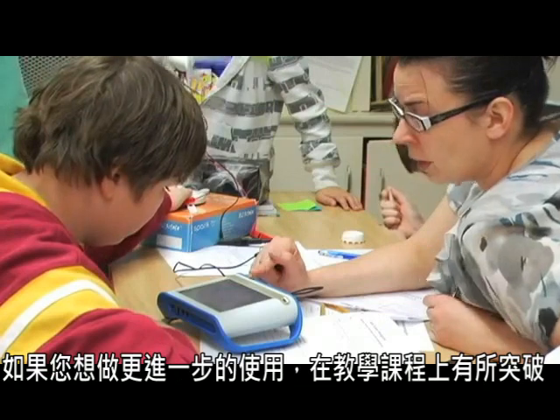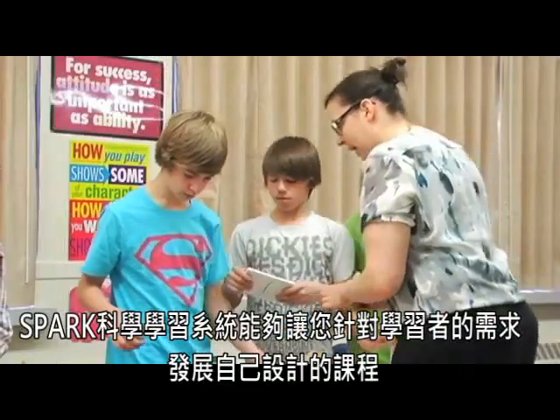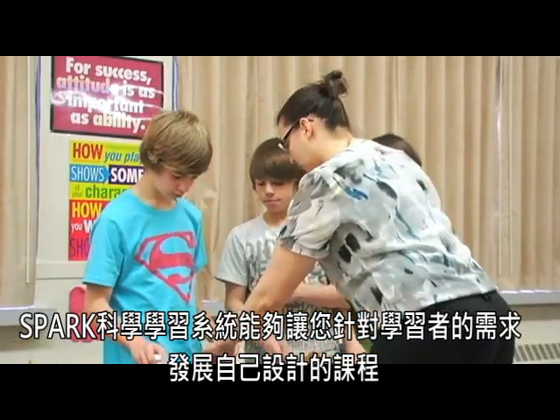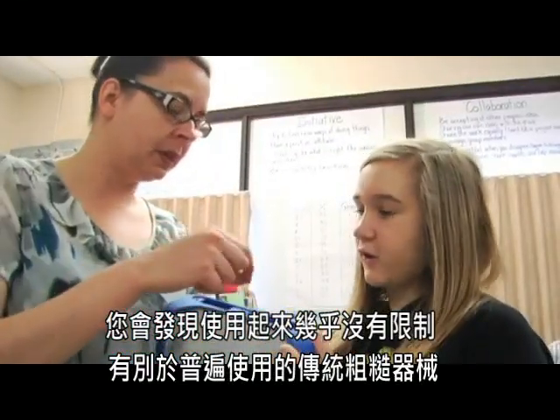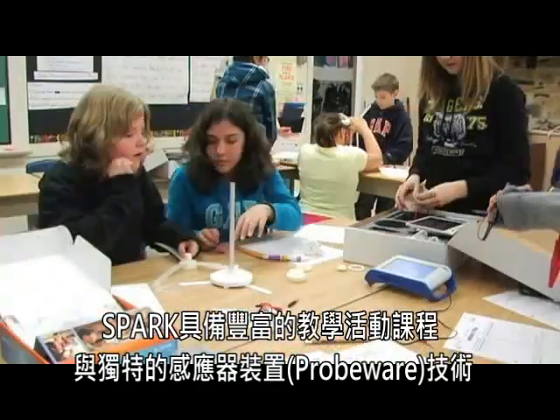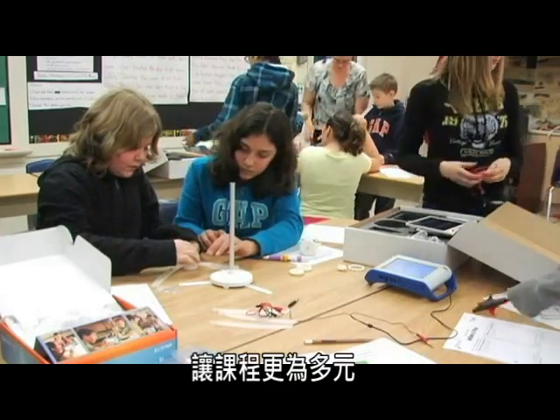If you're more of a science teacher that wants to take it to the next level, that technology certainly allows you to develop your own lessons in inquiry to meet the needs of your specific learners. And the sky's really the limit, because you can do so many more activities with this particular probeware than you normally would with the kind of crude instruments that are generally found in elementary schools.